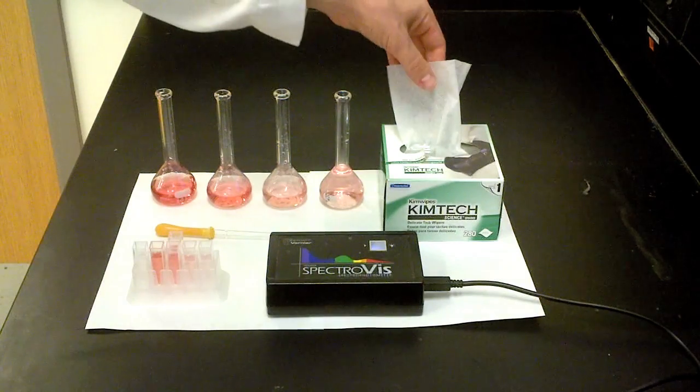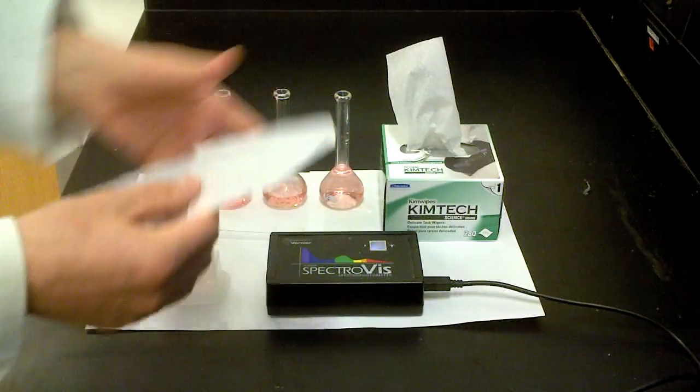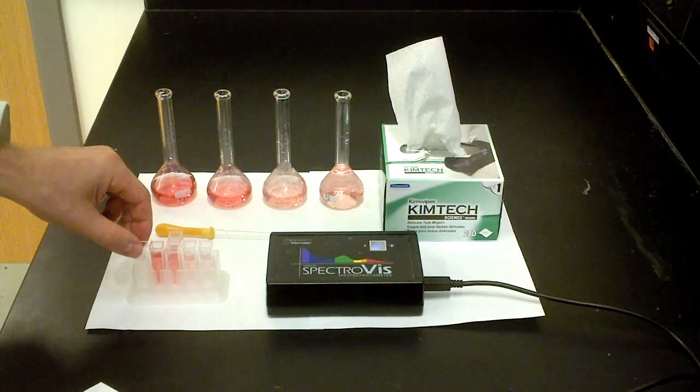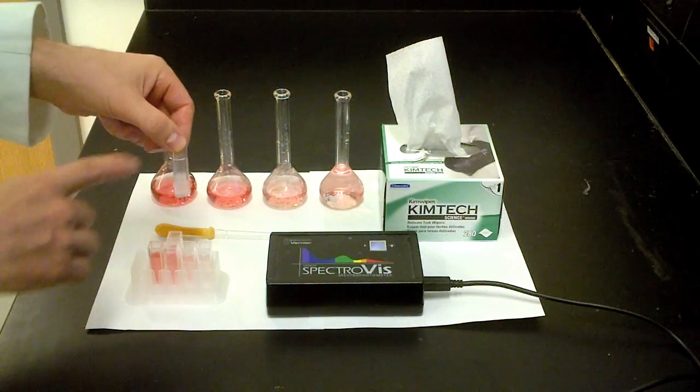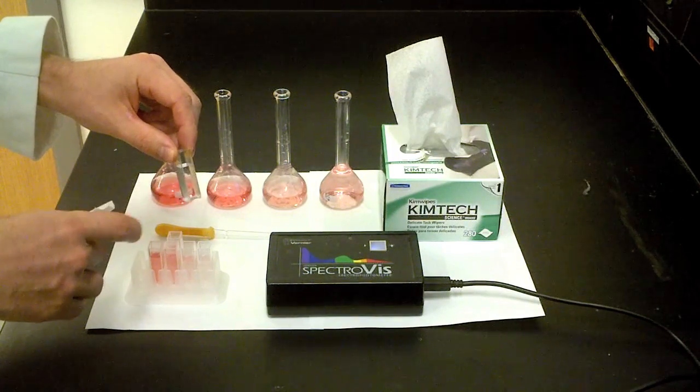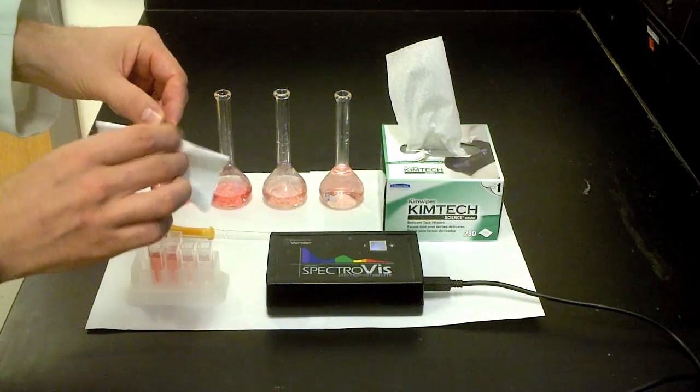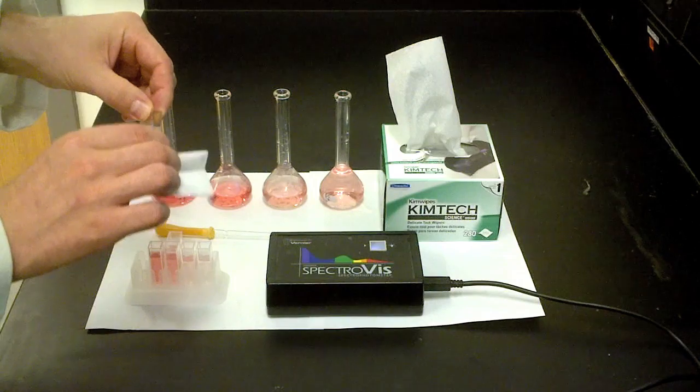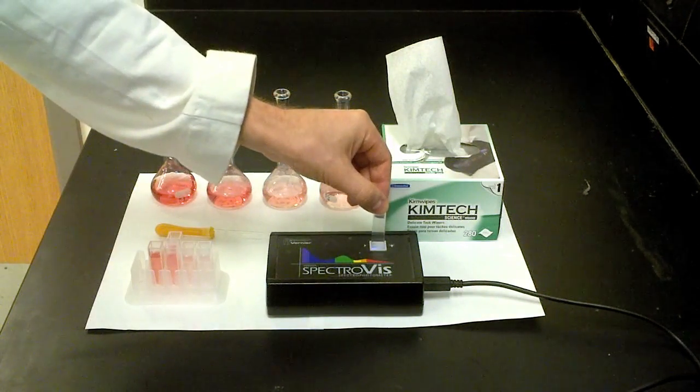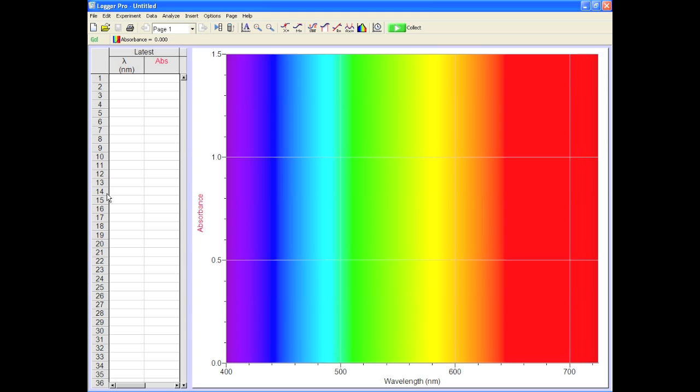Now, the spec is no good if it's not calibrated with your blank, so pay attention. In this case, your blank will be a cuvette of DI water. Check out the different surfaces of the cuvette. Make sure to put it in with the smooth side facing the light bulb icon on the spec. If you screw this up, you'll get dodgy results. Give your blank cuvette a rubdown to remove greasy fingerprints and dust from the smooth surfaces and place it in the spec.